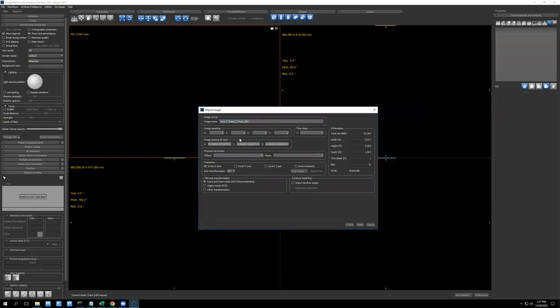When you CT scan something, it actually gives you a mirror image of that in the reconstructed data. So if you invert it on the x-axis, your left side will really be your left side and the right side will really be the right. If you don't, it won't. We prefer to do that. So that's the first thing you do. Because this is this file type, it already tells you what the image spacing is from the data. So it already knows it's 2.08 microns.